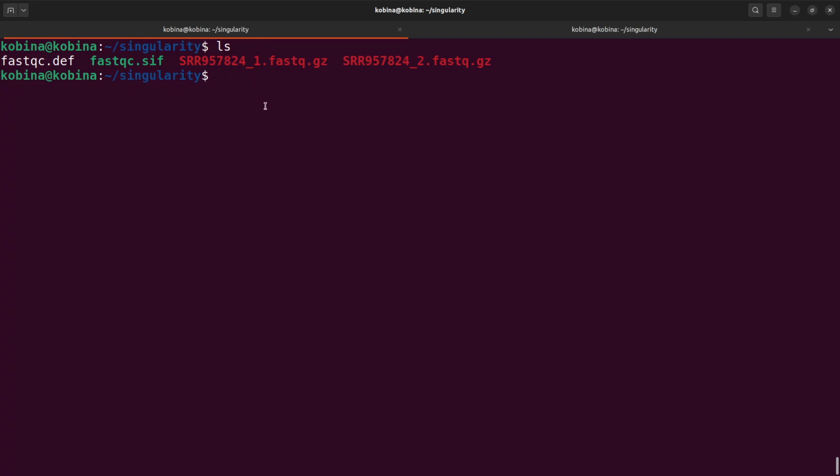So here we say singularity exec, just like we did, specify your .sif file, which is fastqc.sif, then fastqc *.fastq.gz. Let's run this command.